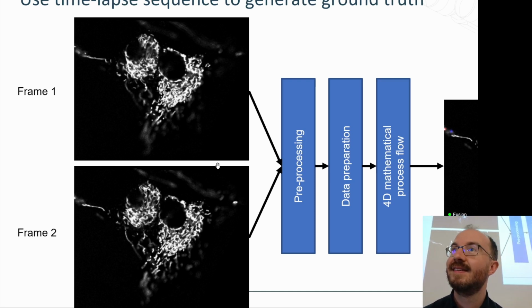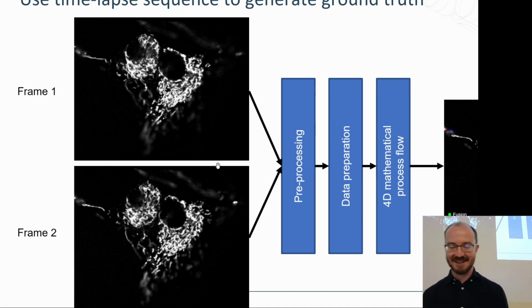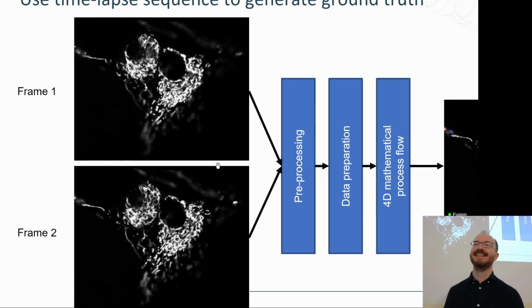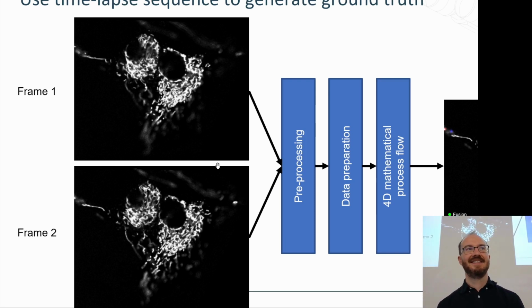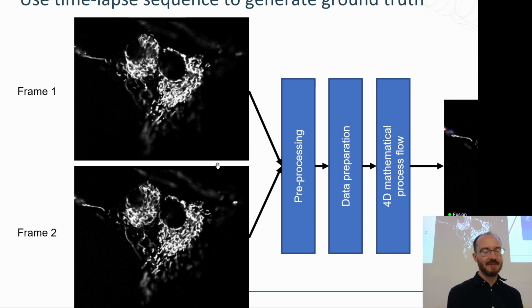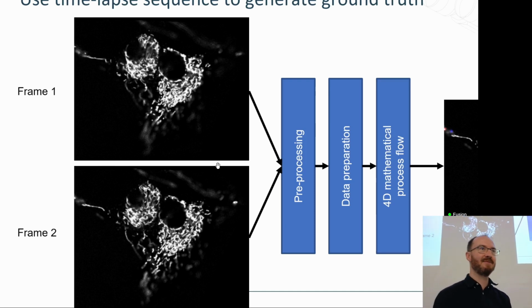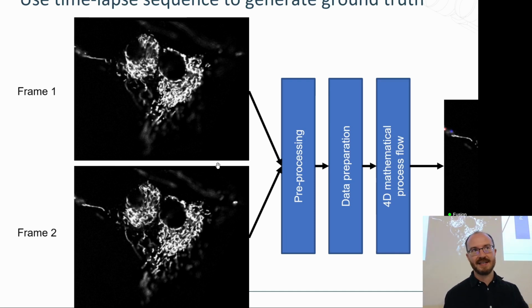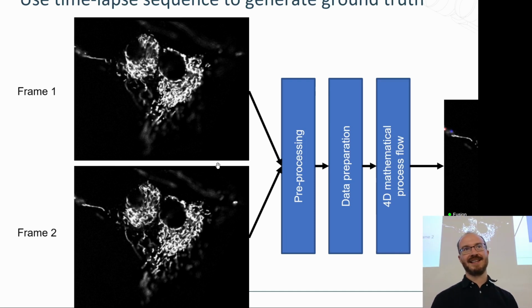Say again? No. This one you're not going to train a neural network for. This one you actually have to figure out just by manipulating your matrix of values. Given what you now know, how would you define change? Okay, sure, but tell me the analysis process that you would follow. I would first do this operation, then this operation, and then finally I know this is where the values changed. What would that pipeline look like? Okay, but do I just apply this on the entire image? So where did the events actually happen?